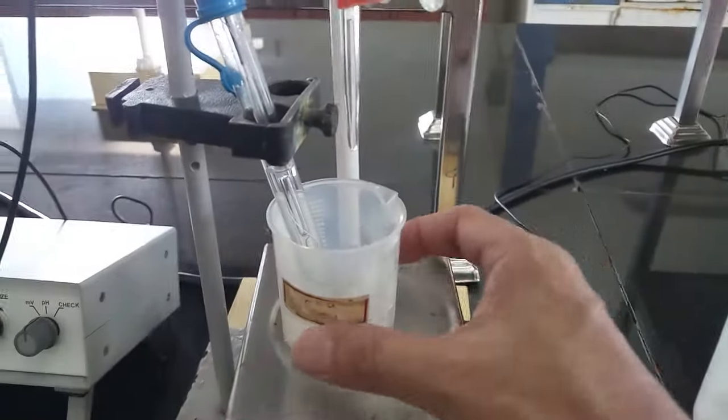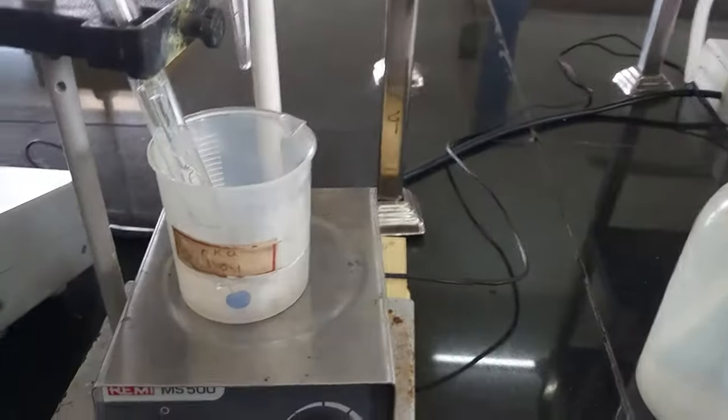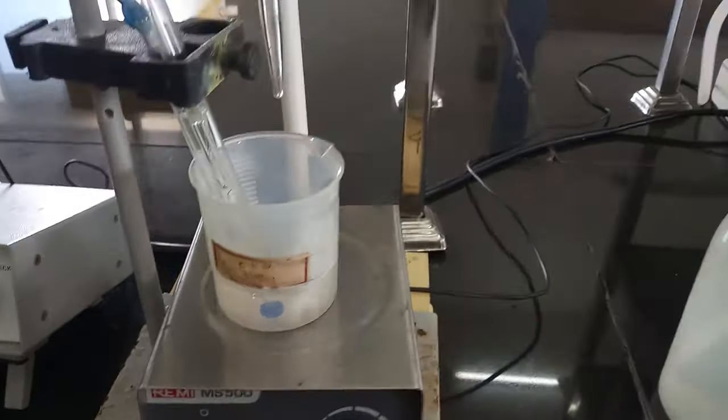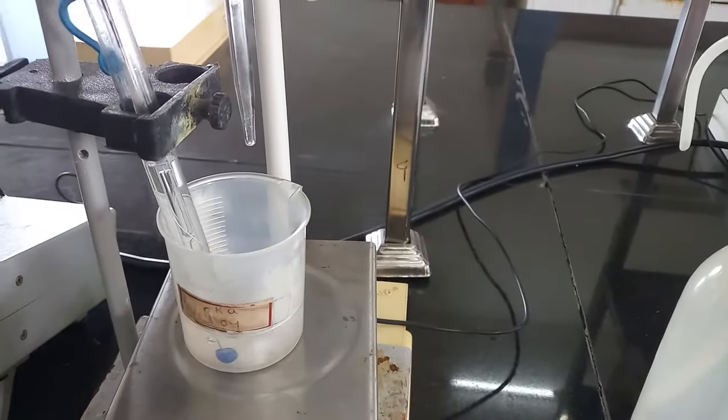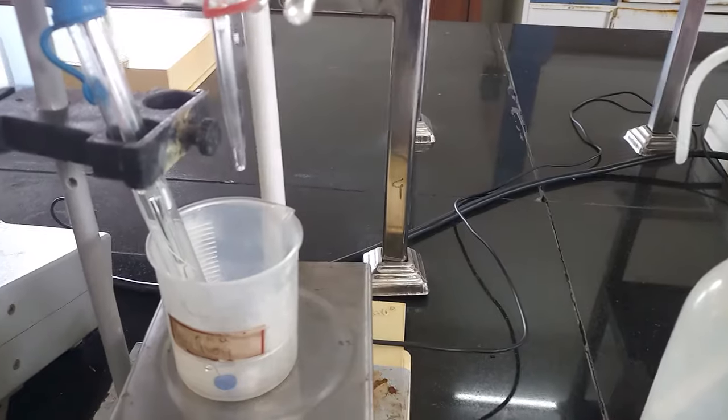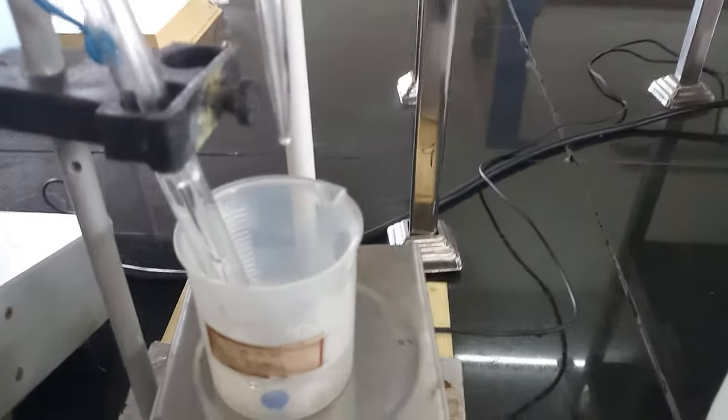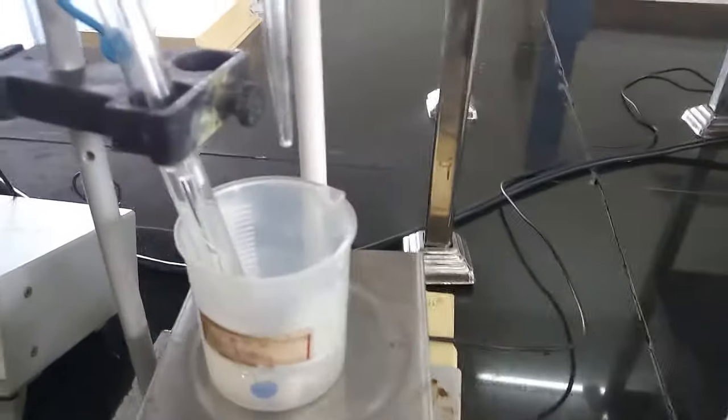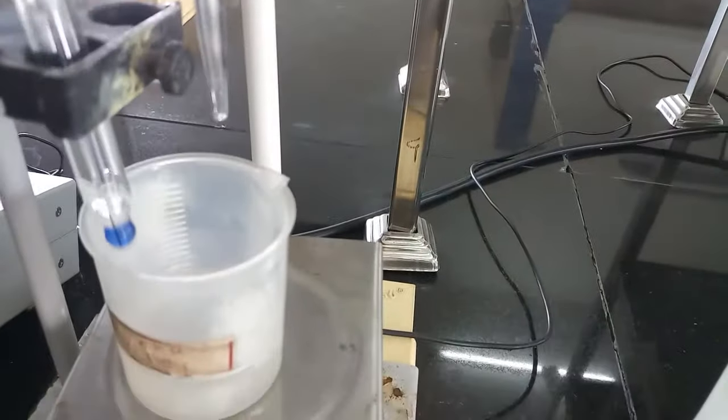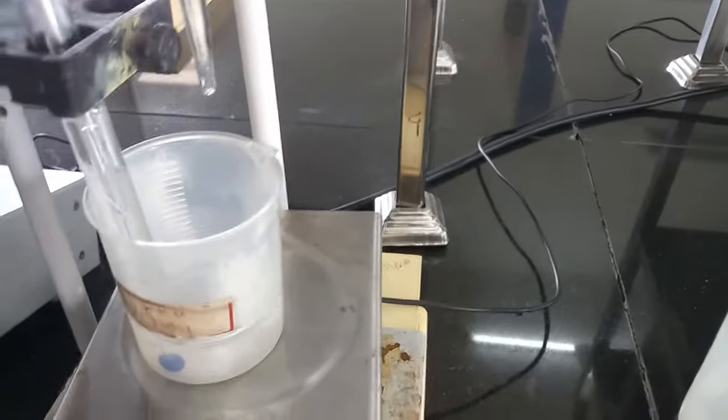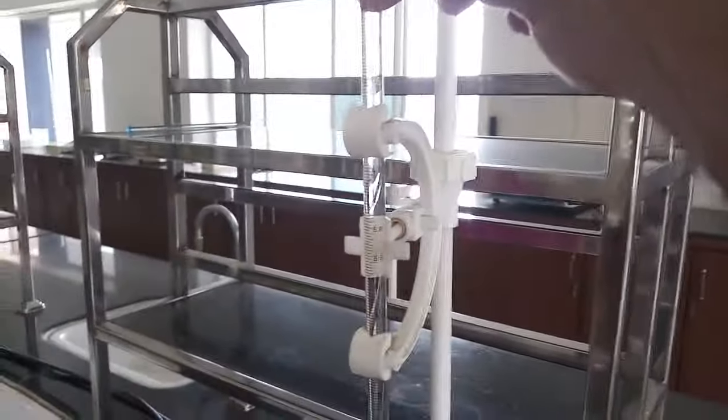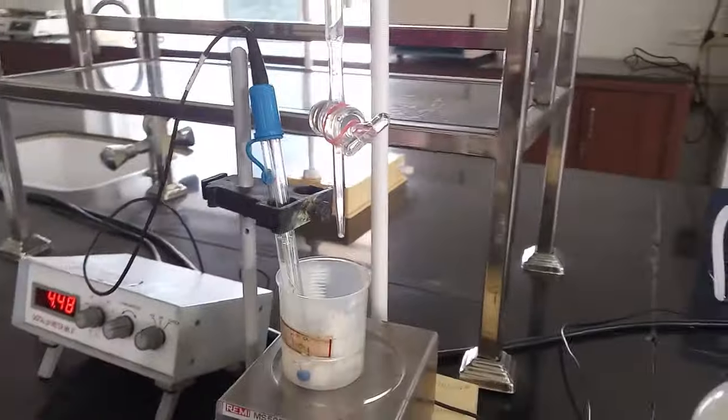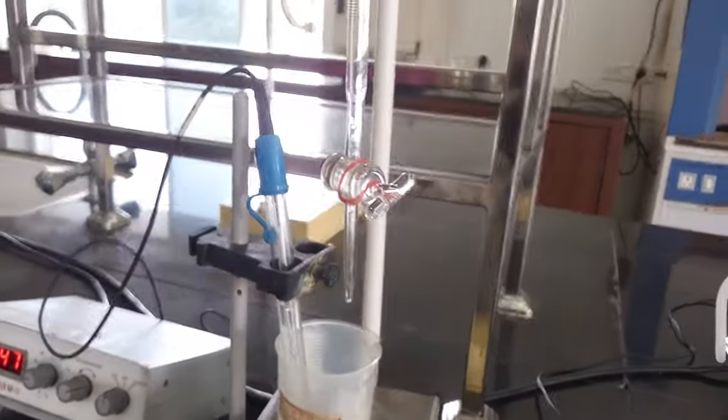So here we require the weak acid, acetic acid, and the pH electrode. Now this is the combination of glass electrode and standard calomel electrode. The pH electrode is dipped in acetic acid solution in the beaker, and the burette contains standard solution of sodium hydroxide.